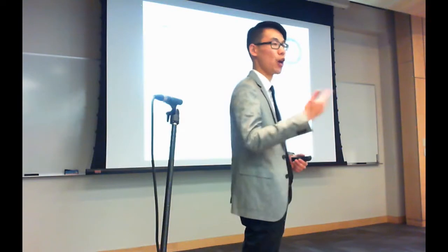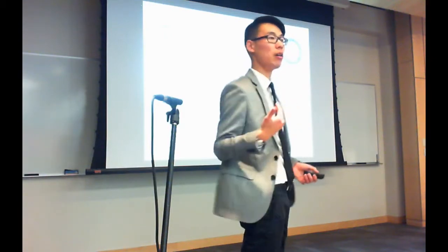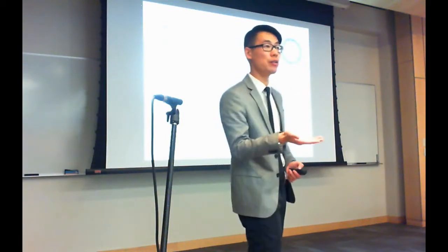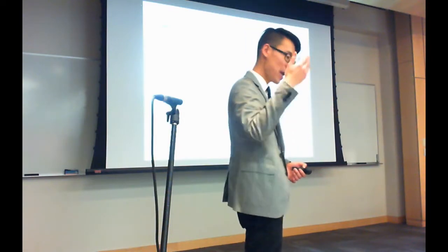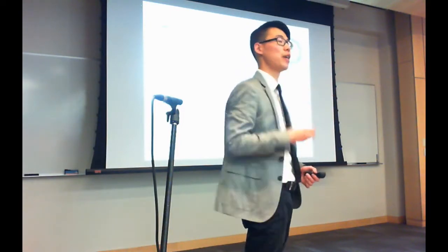Whenever you do database search, there's always error. And so we actually capture that identification error in the libraries. We keep database decoys along with the library. About 2,000 of the spectra in our library are decoys, and we throw that in with the matching when we do the library search. If any spectral match happens between those decoys from the database search, those are also counted as decoys.